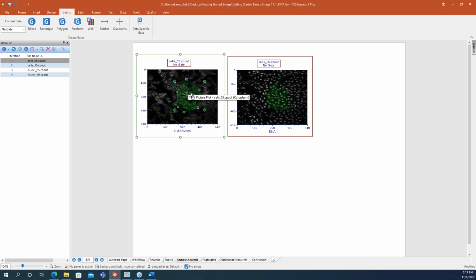So when I'm selecting cells out, I have that flexibility to work back and forth between 2 samples. And as I update anything, my plots are integrated, so it's going to update for everything else.